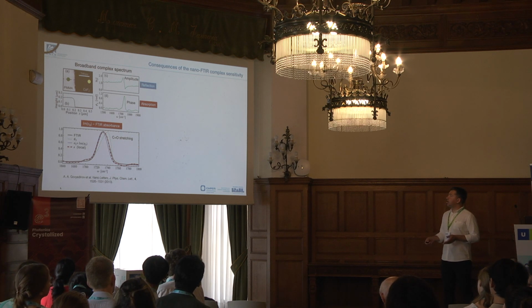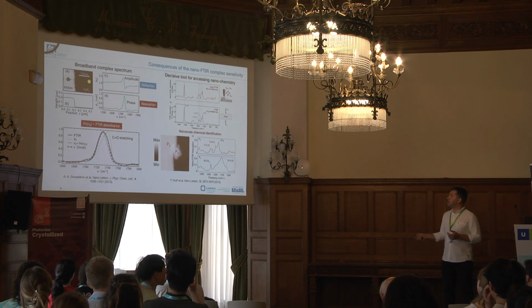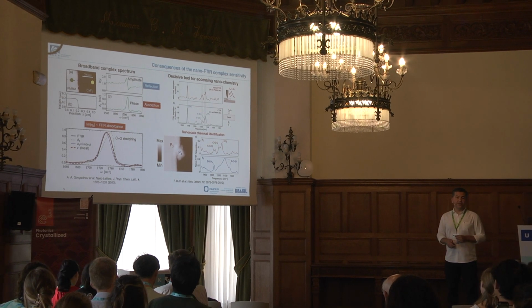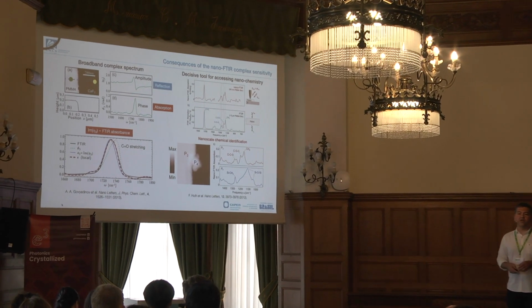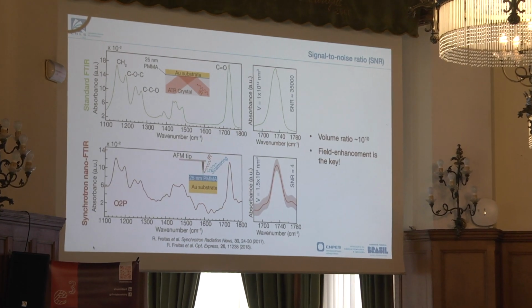As I mentioned, when this paper came out, this was a real attractive thing for the classical FTIR community to enter this nanoscale field.